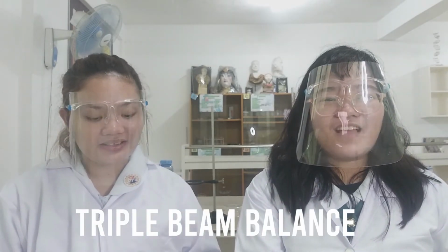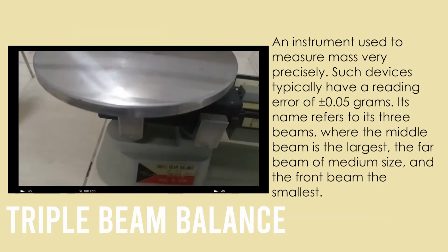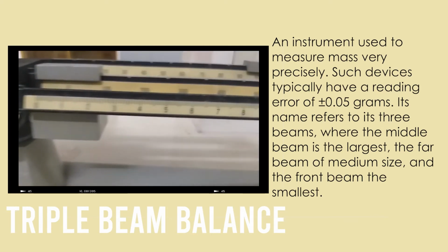Now, let's continue with the haul. We also have to, of course, measure mass every now and then. Good thing that we've bought that item in our haul, the triple beam balance. It is used to measure mass directly from objects and even find mass by difference for liquid and measure out substances. Isn't this weighing tool great?